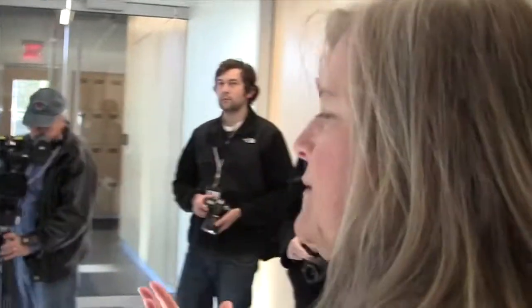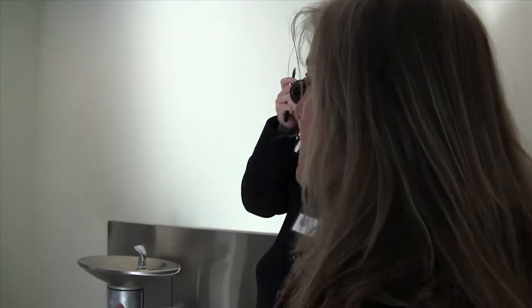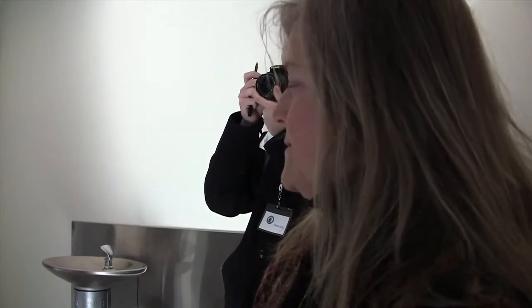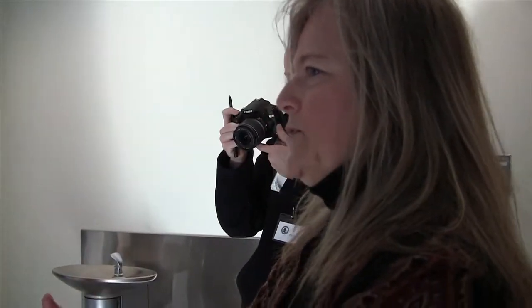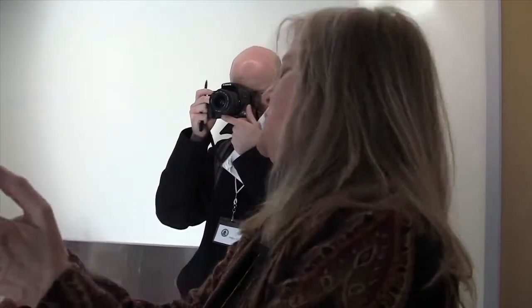A number of technologies were developed in this facility before it moved here, of course, but it's actually led to a spin-off company called Fluid Imaging Technologies in Yarmouth. They developed here a way to sort cells out of ocean water, and not only sort them and count them, but to get images of them as they flow through. They essentially put a laser beam through and are able to individually select cells that are microscopic. The individual cells are about 1/5 of the width of a human hair. So this is very tiny stuff.